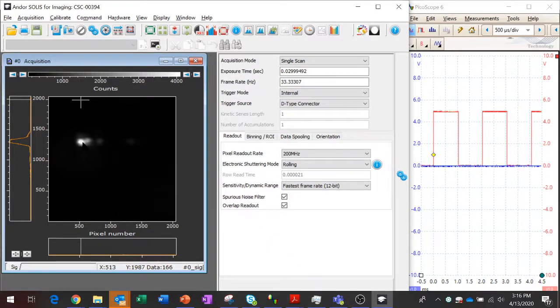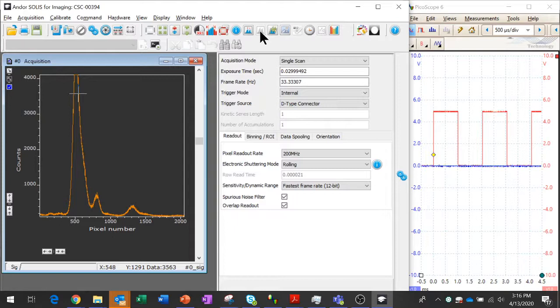So if I view this as a spectrum, you can see I've got a lot going on here. I want to separate the individual channels out rather than have them all mushed together in time. Here I've got my blue, green, and red channels overlapping, and here I have the second order diffraction pattern. But I want to be able to catch individual frames or individual channels, and I'll show you how to do that. So first, I'm going to go back to an image view here.